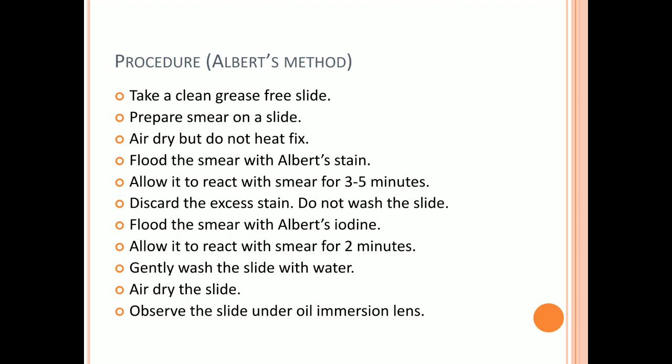Flood the smear with Albert's iodine and allow it to react with the smear for 2 minutes. Gently wash the slide with water. Air dry the slide and observe under the oil immersion lens.